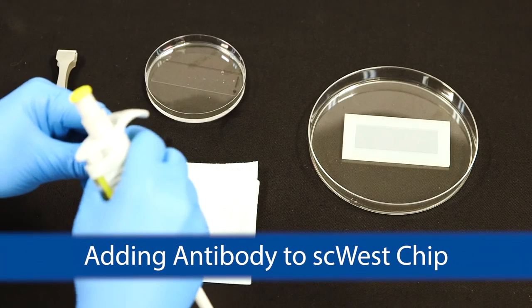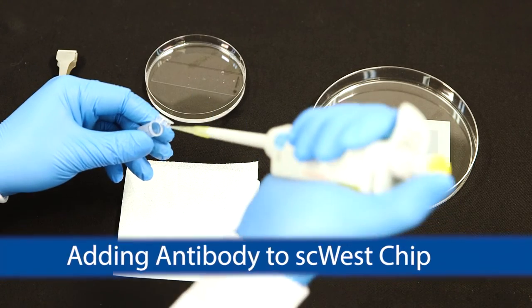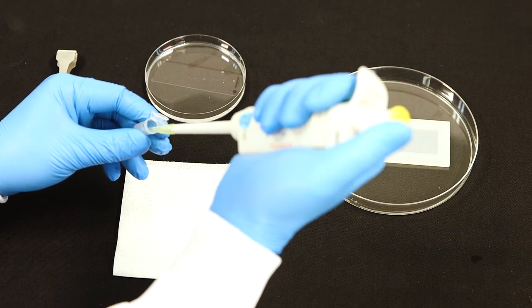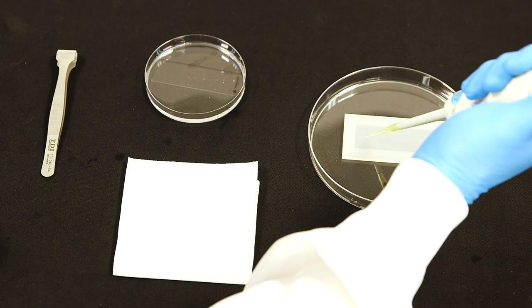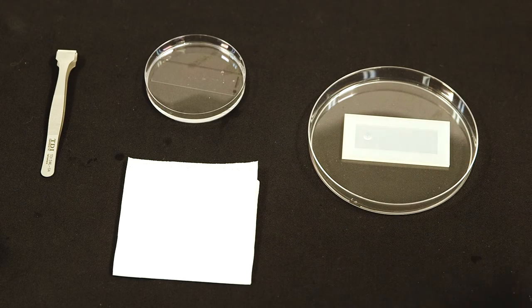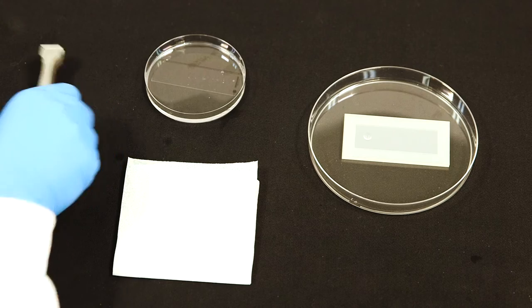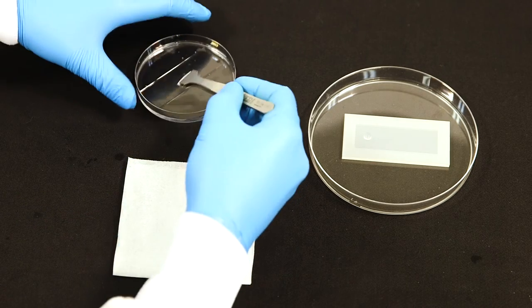Much like the gel surface, it is important to keep the probing fixtures clean, free of dust and other contaminants. Add 80 microliters of your antibody cocktail solution to one end of the probing fixture reservoir.